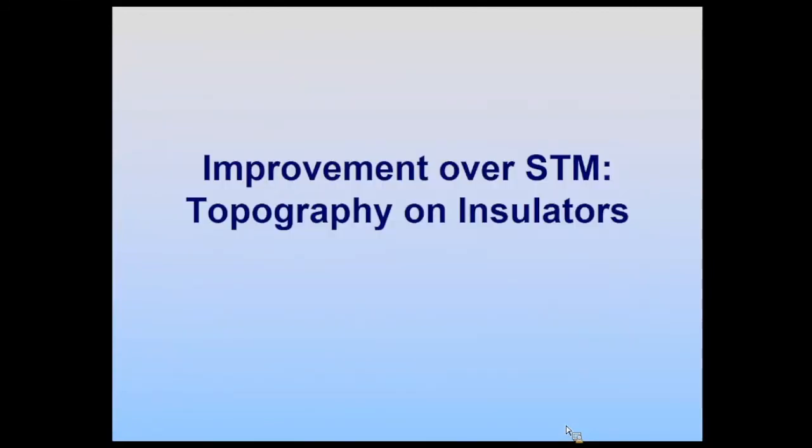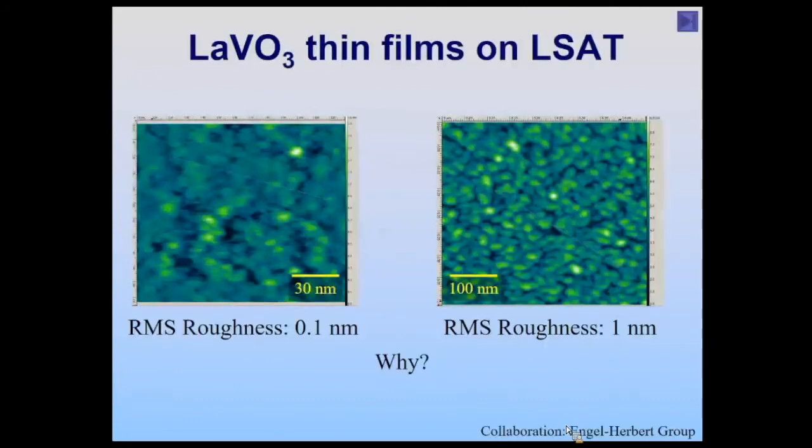So, why AFM? Well, one thing is that you can do things that you can't do with an STM, and one of those is work on insulators. Right? So STM has no hope of working on insulators, but AFM can. Here's just one example of that.